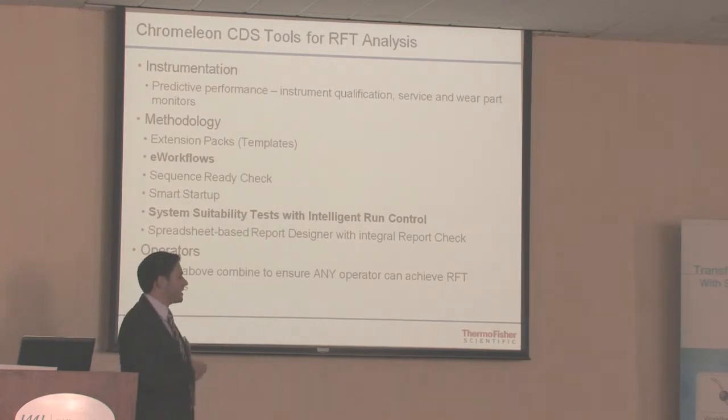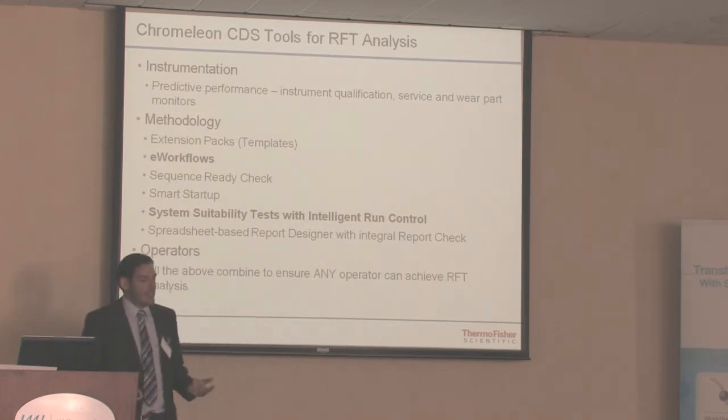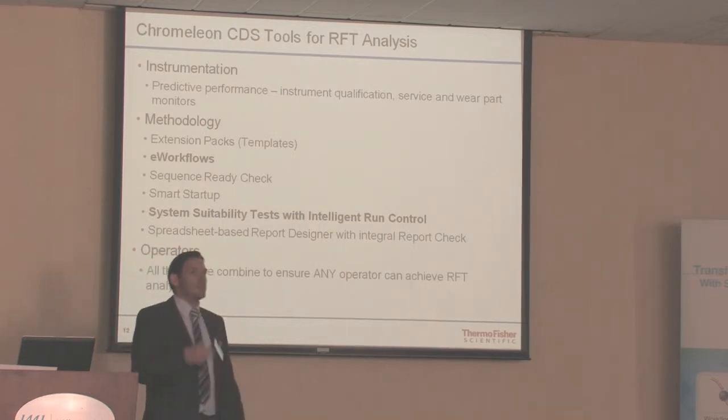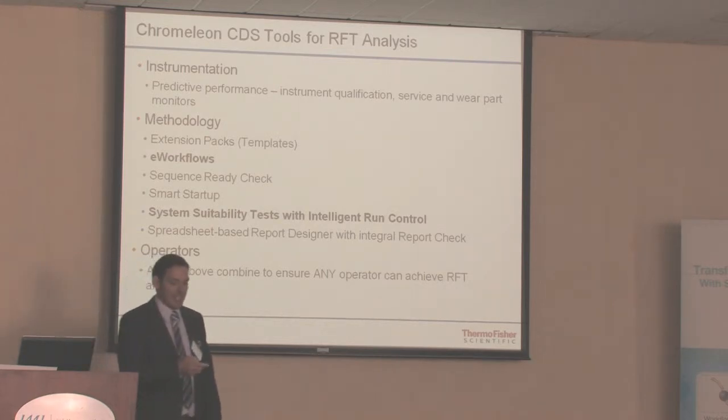For extension packs and templates, we have templates for ICH, content uniformity, a lot of the rest, but they are there. Security checks, I know. So I always forget the one that there's one missing for it. I think it's related to subs. That one's not quite there yet, but it will get some.